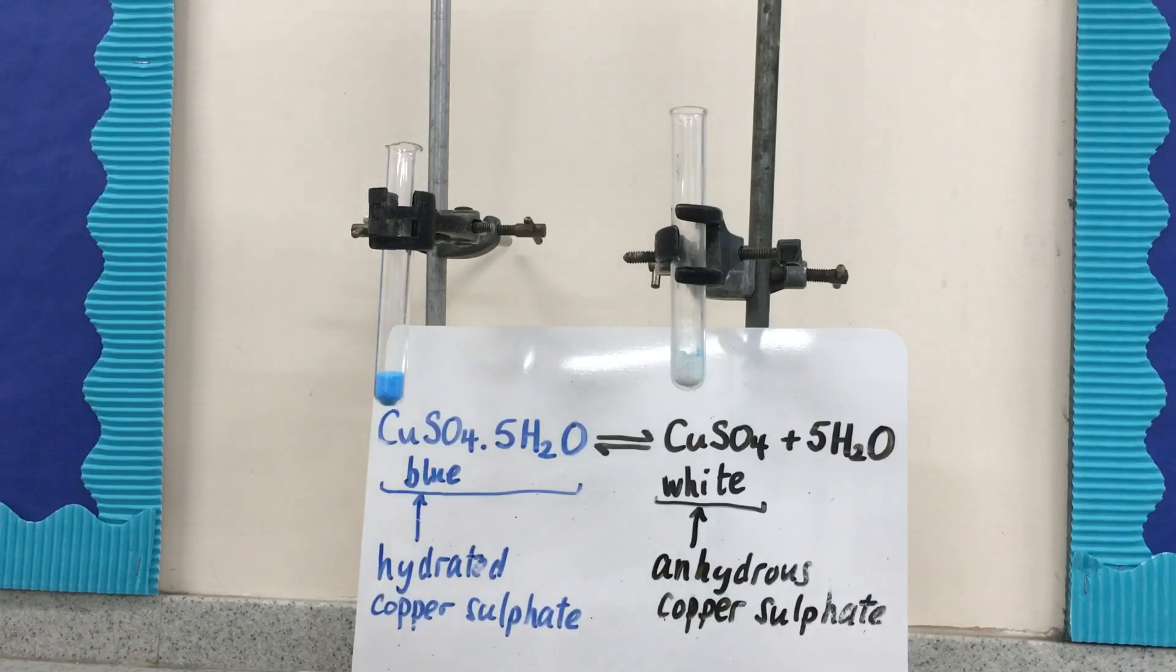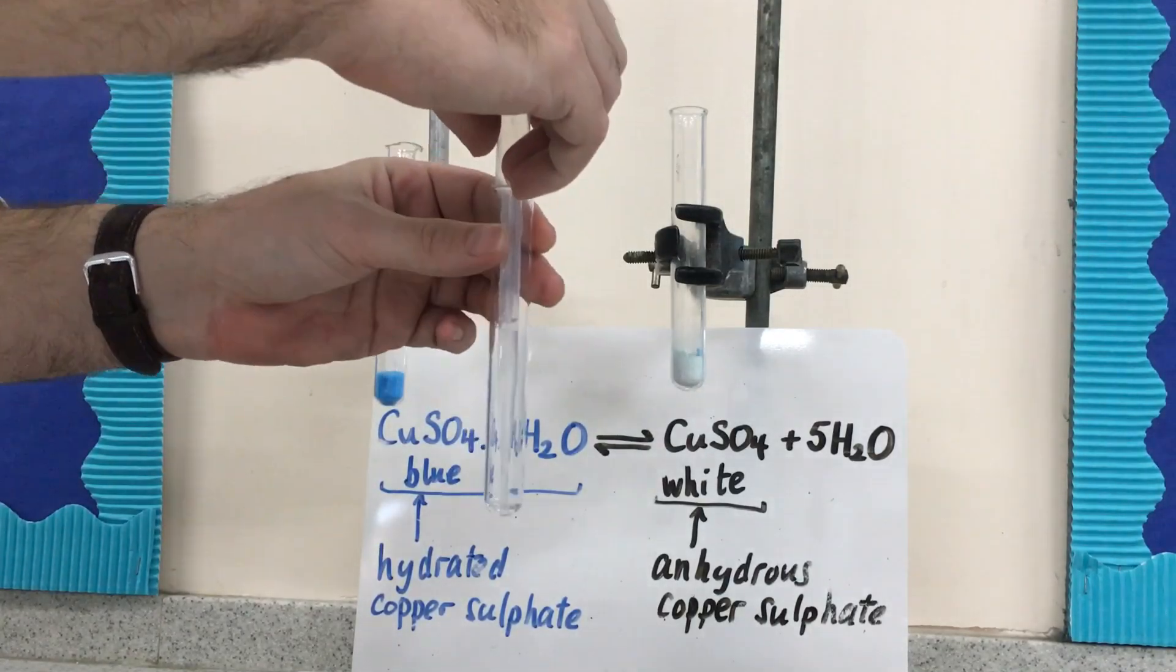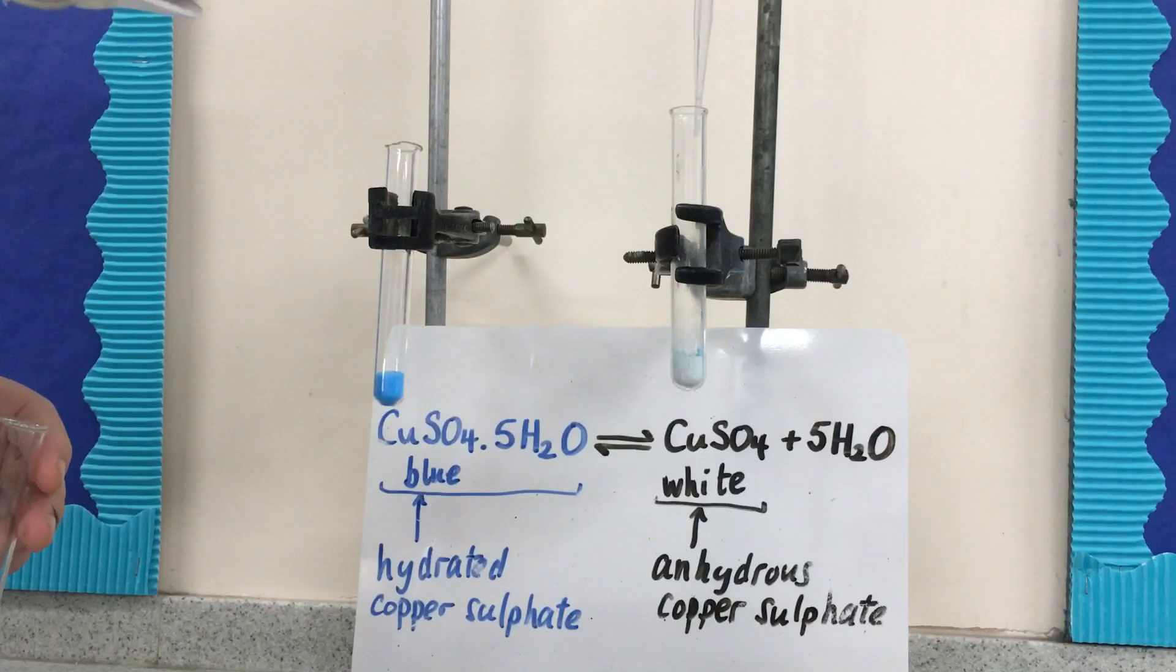So this is some water. If we add it to our white copper sulfate, it'll turn blue.